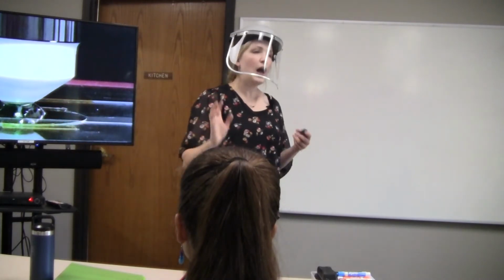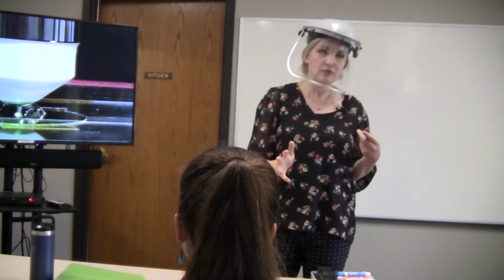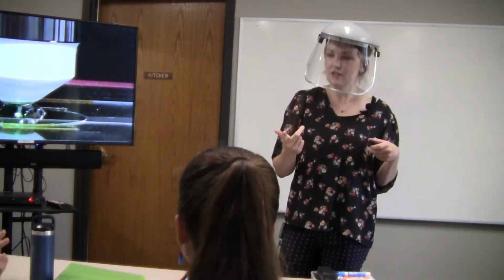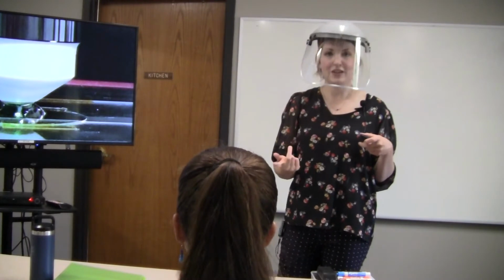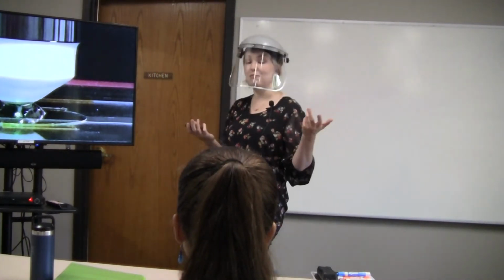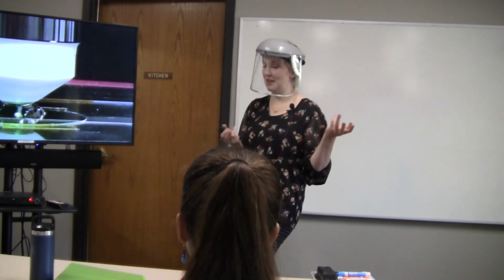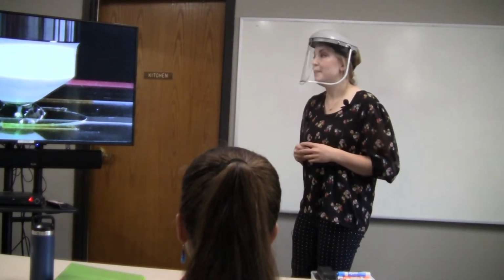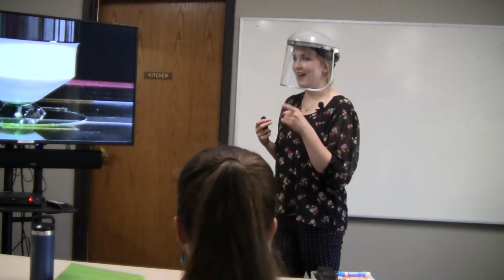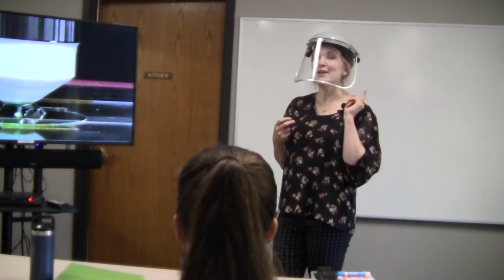Why do you use a drop of oil? Does anyone have any guesses? Liquid magnifies. Okay, liquid magnifies. So it won't scratch the lens. Both of those are really good answers, and each of those might play a factor into it, actually. But isn't the oil going to distort the image that you see? Actually, it makes it more clear.